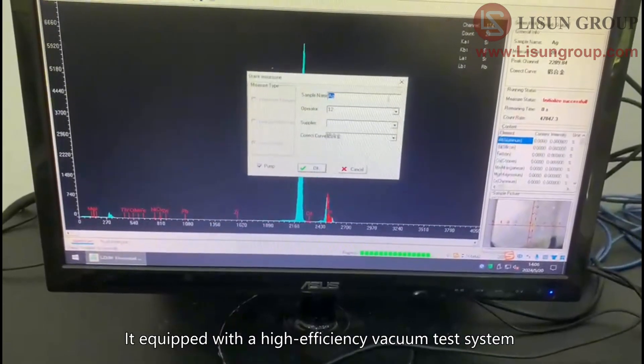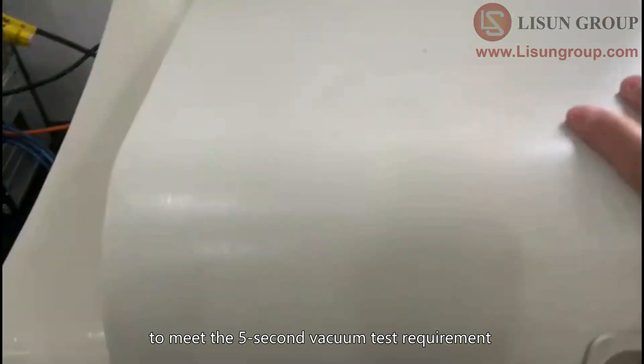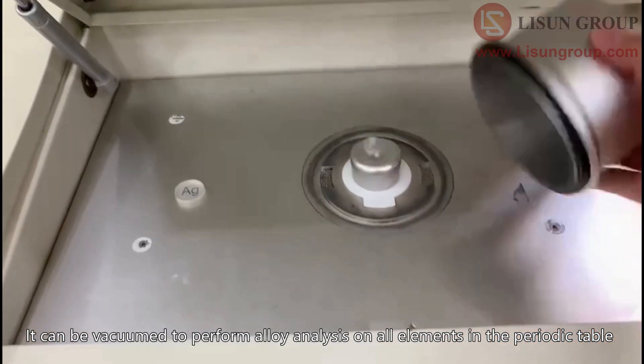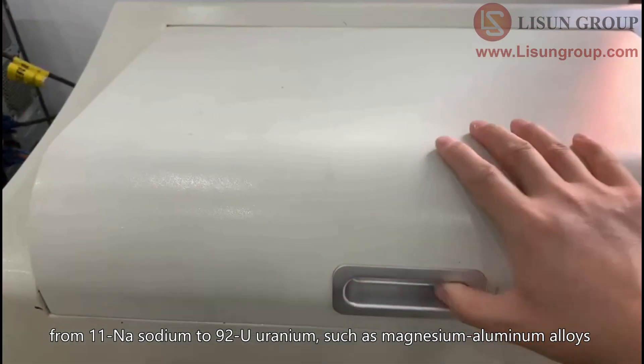It is equipped with a high-efficiency vacuum test system to meet the 5-second vacuum test requirement. The light element detection range extends to sodium element. It can be vacuumed to perform alloy analysis on all elements in the periodic table from 11 sodium to 92 uranium.